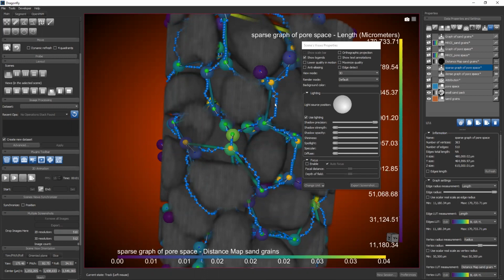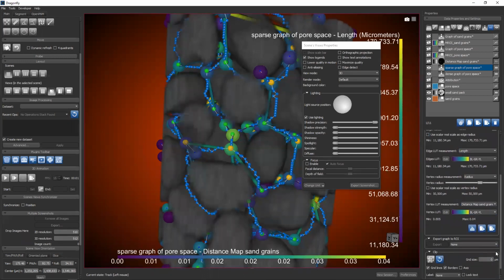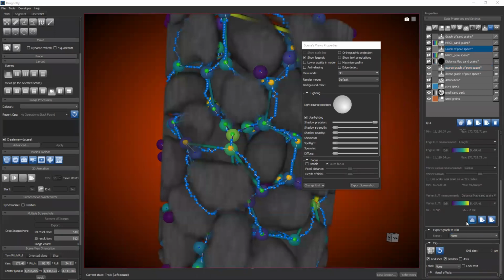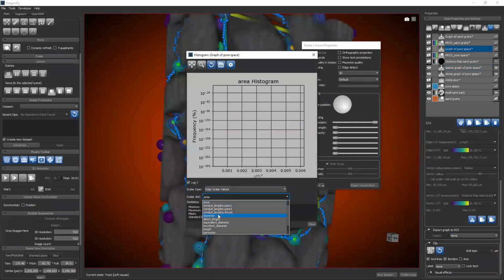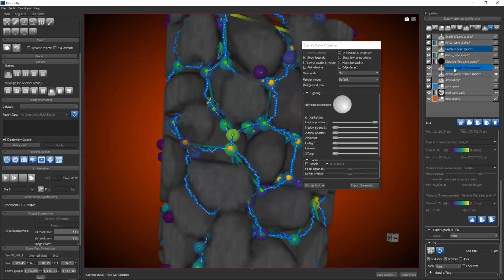Okay, someone asked about pore size statistics. So you can get the pore size statistics out. If you have computed volume, for example, if we look at this graph of the pore space, among the measurements we have here, let's see, do we have volume? I'm going to have to look into this. I don't see that the measurements on the OpenPNM are being reported properly.